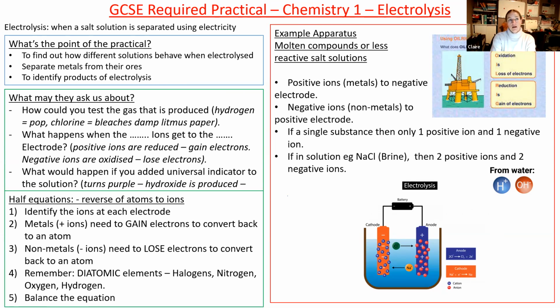So therefore, it is again to do with ionic bonding. It's a metal with a non-metal, and the metal has a positive charge and the non-metal has a negative charge. We need to separate those out, and we do that through electrolysis. You have to remember how the apparatus is set up. It's a circuit. When you stick the electrodes in, your negative one is called the cathode and your positive one is the anode. It is not a complete circuit until you put the electrolyte, which is the solution, into the container.